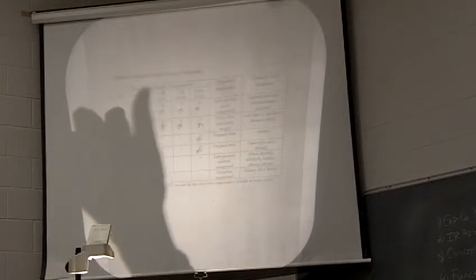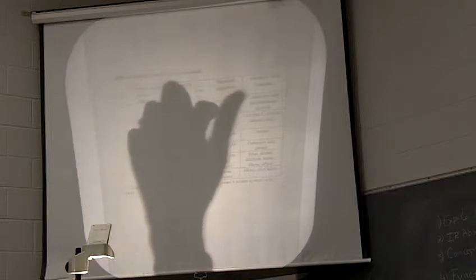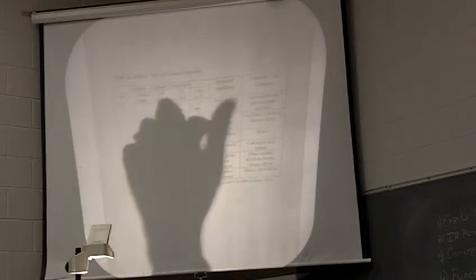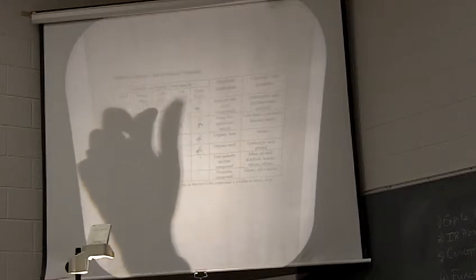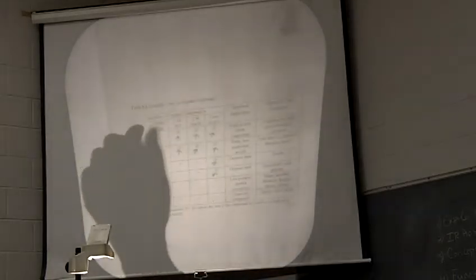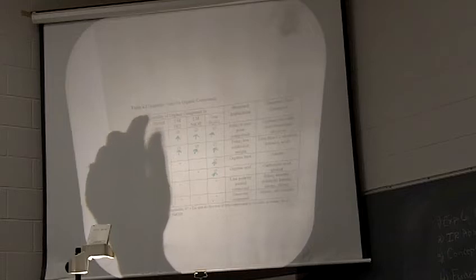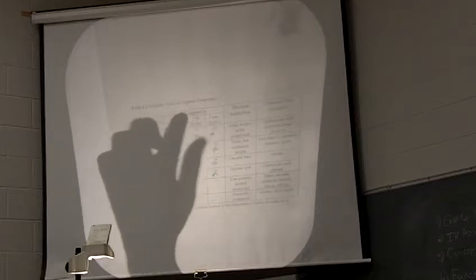So with the table, you want to make sure, follow the pattern. If it tells you don't do the rest of the test, then don't do the rest of the test, okay? So depending on what pattern you get for solubility, that will determine what other tests you're going to keep doing. But make sure that you follow what is in this table, okay? And like I said, this is in your lab manual, all right? So the five things you're testing are water, which you can just use a little bit of RO water, diethyl ether in the red cans, 1 molar HCl, 2 molar NaOH. Those are both in bottles.